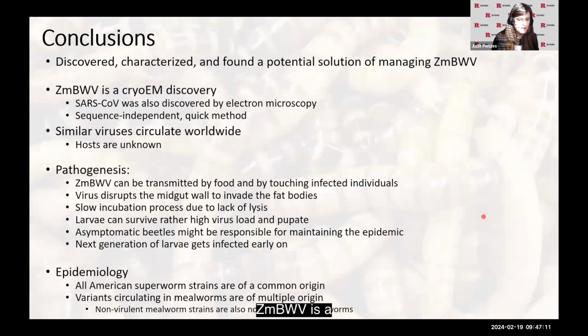ZMBWV is a cryo-EM discovery, which suggests that cryo-EM is indeed a suitable alternative virus discovery method to assess the pathogen behind a pandemic.